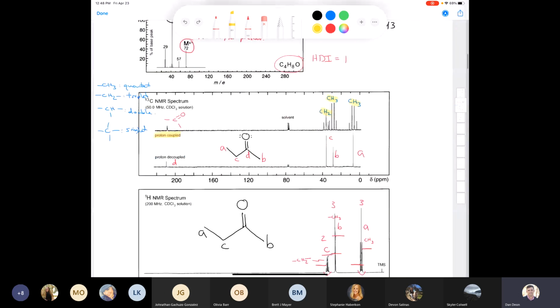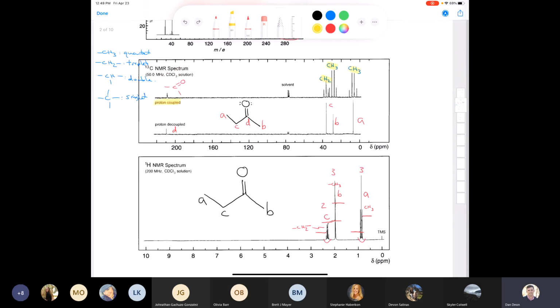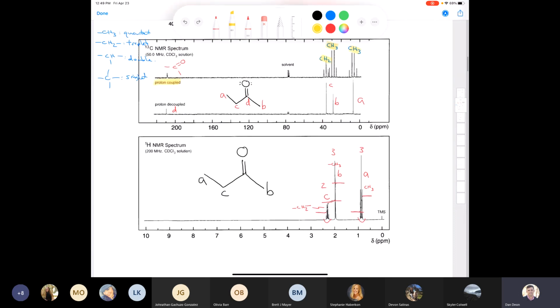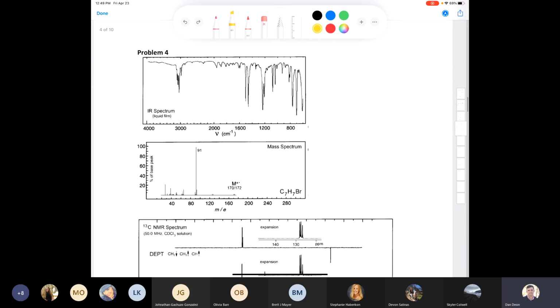Okay, there we go. So we went from butanone. So technically the name of this compound isn't 2-butanone, it's actually just called butanone, but that's neither here nor there because, well, anyhow, I won't explain why. Talk about that later. There we go. And then we did 1,4-cyclohexane dione. All right, let's move along.